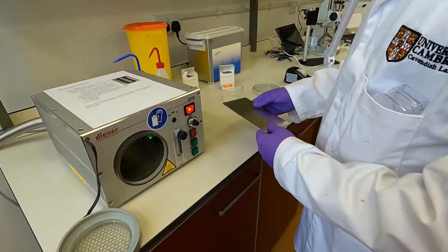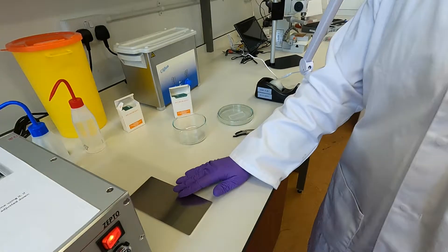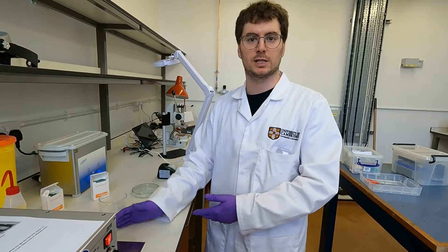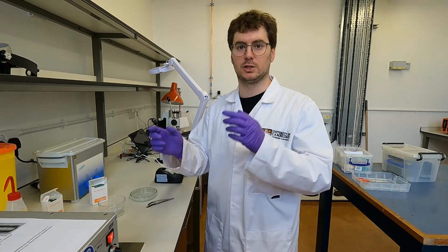We take out this plate, and on this plate we're going to put the PDMS chip and the substrate that we use for the bonding. This is going to be the final substrate used in the experiment. For the sake of this demonstration I will use a standard glass slide for the chip substrate.